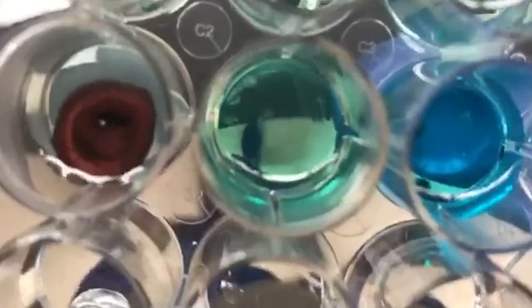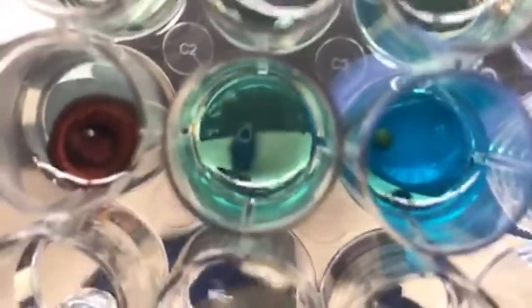As you can see here, the reaction of your different metals with your solutions varies a little bit. Metal A seems to be reacting in the nickel and the copper solution. Metal B is only reacting in that copper solution. None of them are reacting in water.